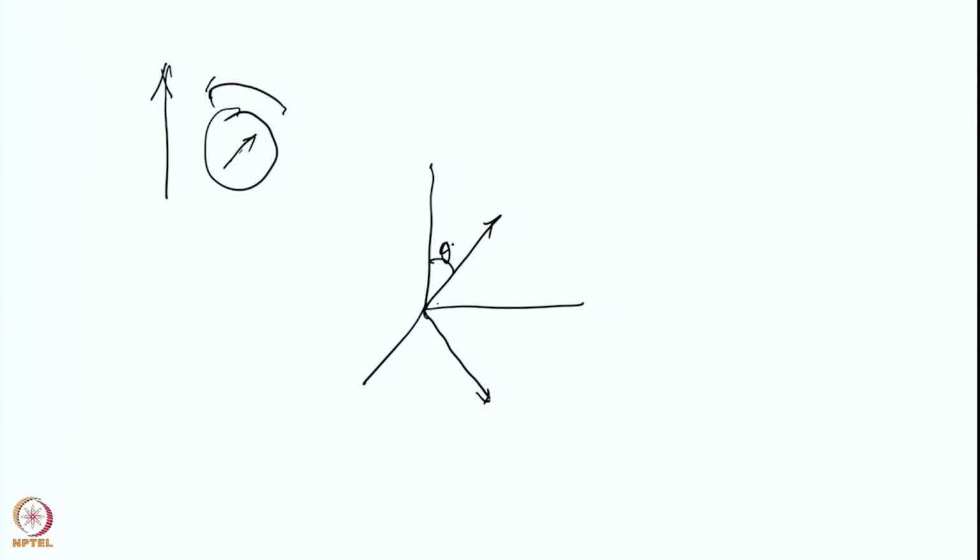So okay, what will happen then? Why does the compass needle move when you apply a magnetic field? Because it experiences what is called a torque. The north pole and the south pole of the tiny magnet will experience forces like this, and since there is a distance between the north and the south pole, it has a certain length. This results in the motion of the compass needle in a particular direction. Here also a torque will be present, but the spin cannot orient itself with respect to the z axis like this. It cannot become exactly parallel or anti-parallel to the field.